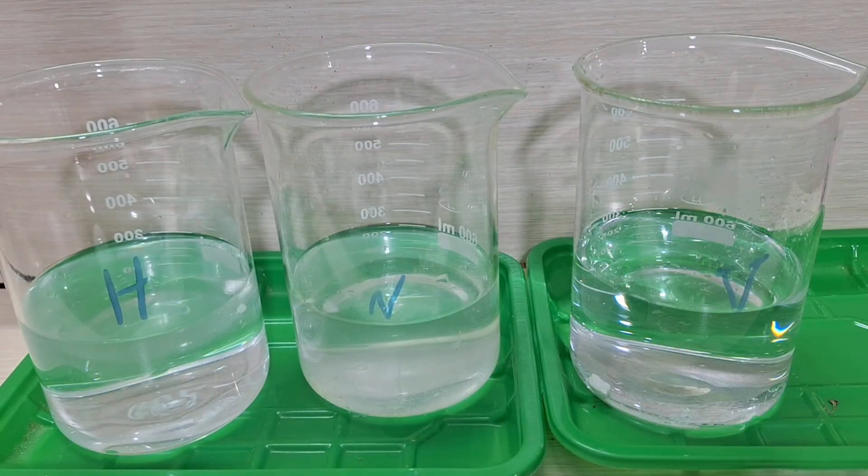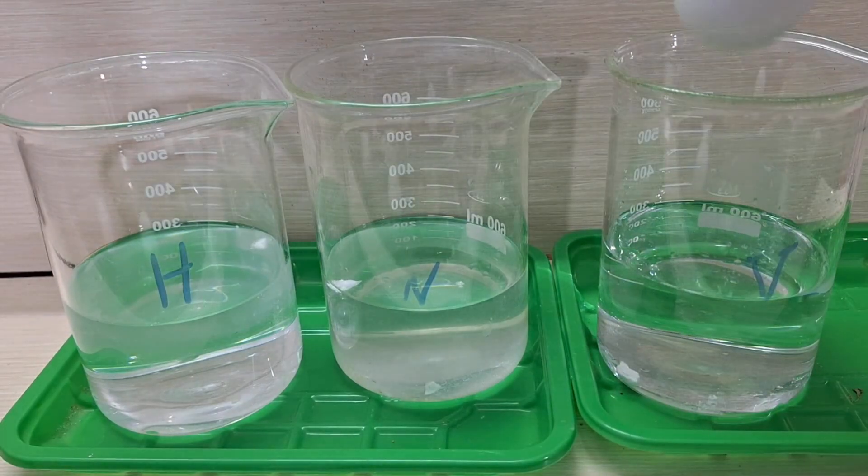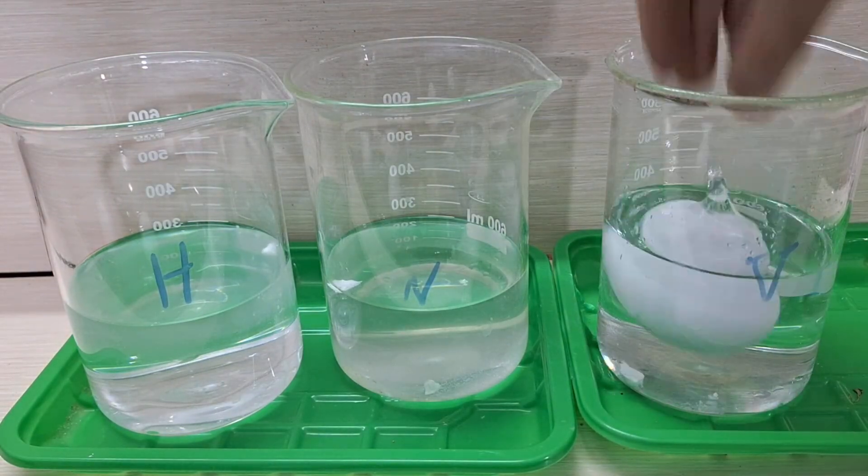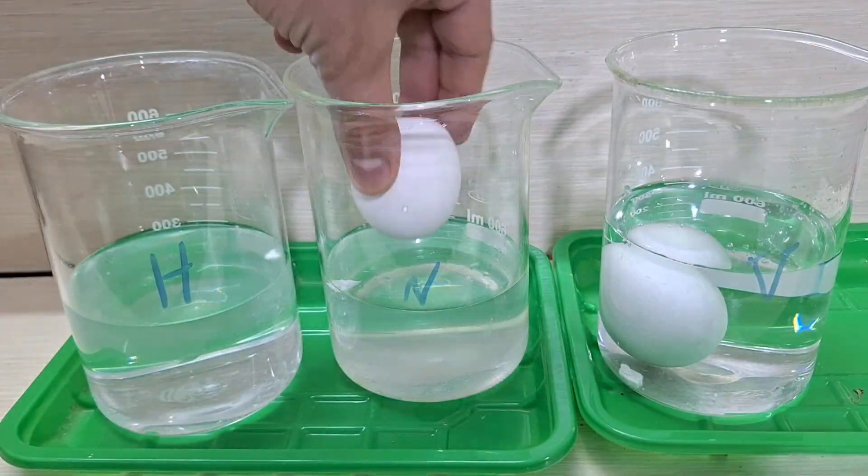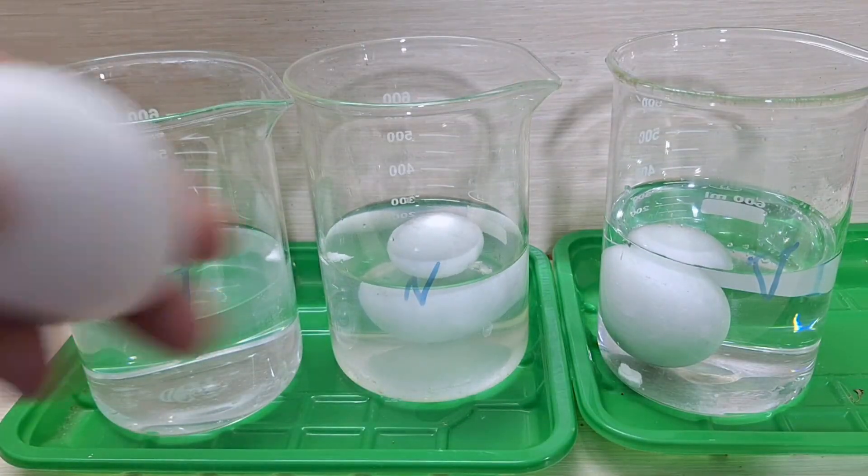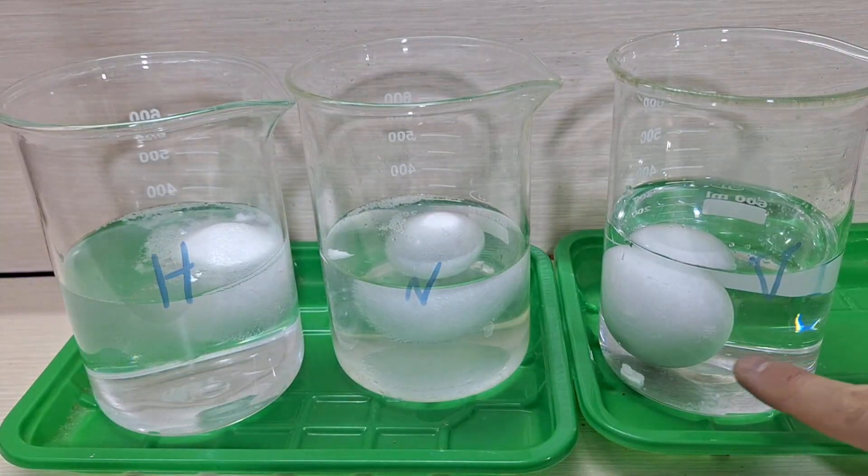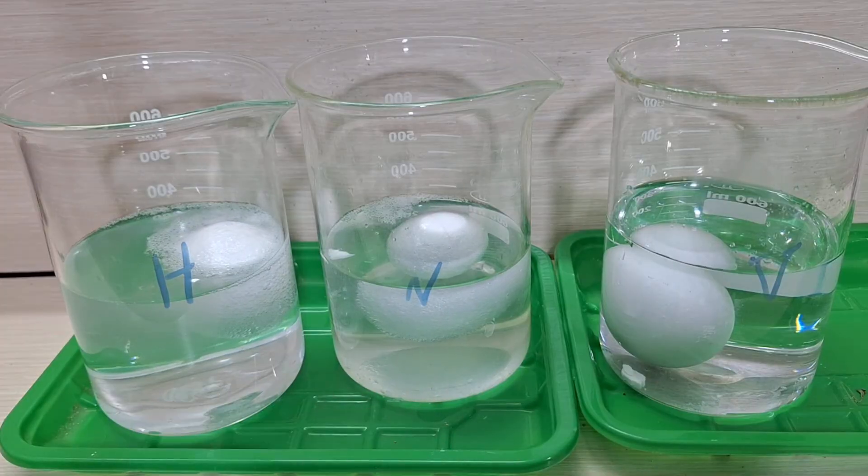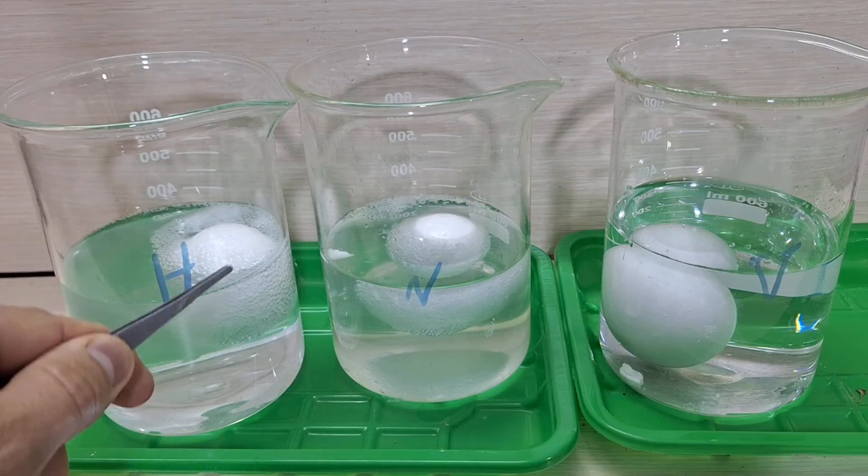Here's the answer. When gold is dissolved in aqua regia, the first step is to remove the nitric acid. This can be done in several ways, for example, by adding urea or sulfamic acid. The key is to only remove the nitric, so we are left with gold chloride. If we use a strong base to neutralize the entire acid mixture, we might destroy both acids, and the gold may not precipitate correctly.